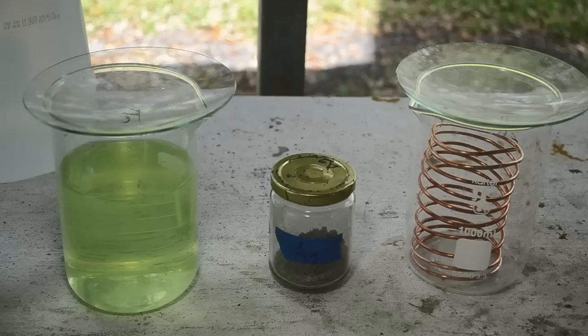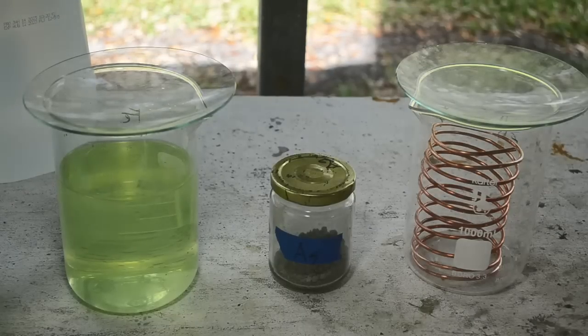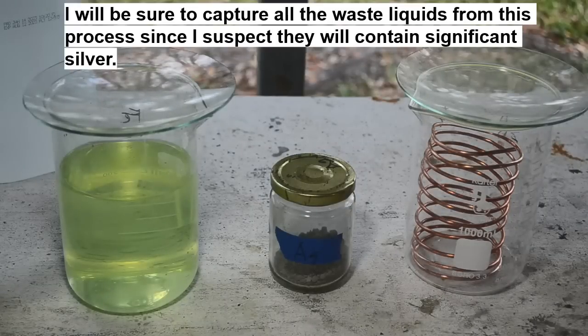Okay. Well, a quick look at about any chemistry text will tell you that sulfuric acid doesn't directly dissolve copper, but I could see how it could dissolve small amounts of it if there's a little bit of oxygen in there to help oxidize the copper up a little bit to where the sulfuric acid can get a hold of it. I'm not 100% convinced it's going to work, but some of my viewers are convinced it works. So we'll give that a try.